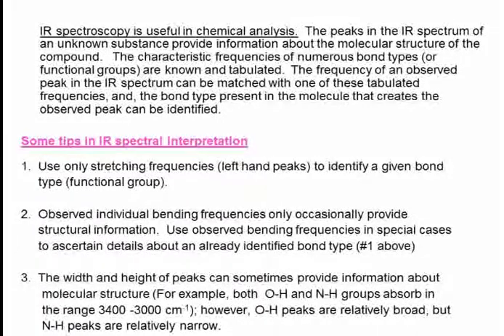IR spectroscopy is an important analytical tool. It finds application in both quantitative and qualitative analysis. In the organic chemistry lab, it's especially useful in elucidating the structure of an unknown compound.